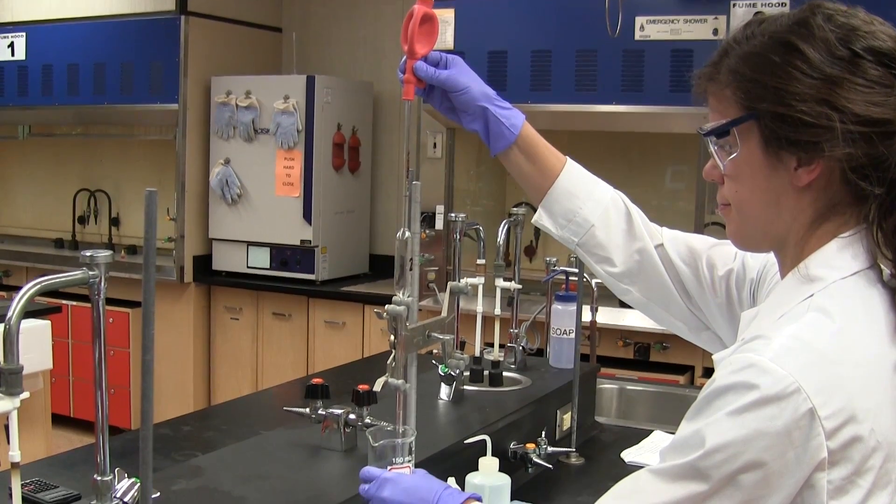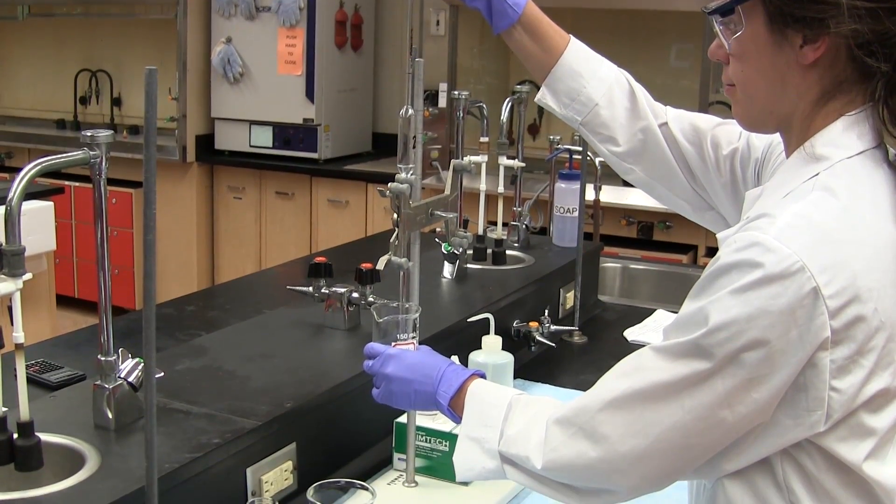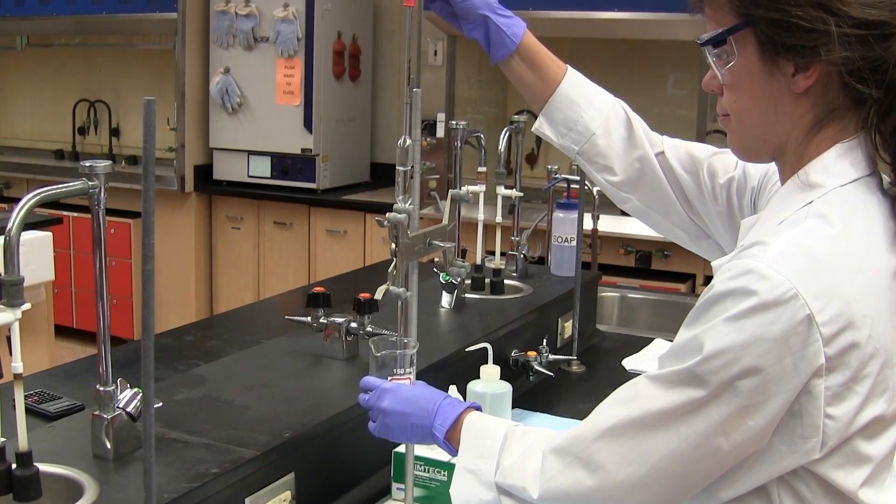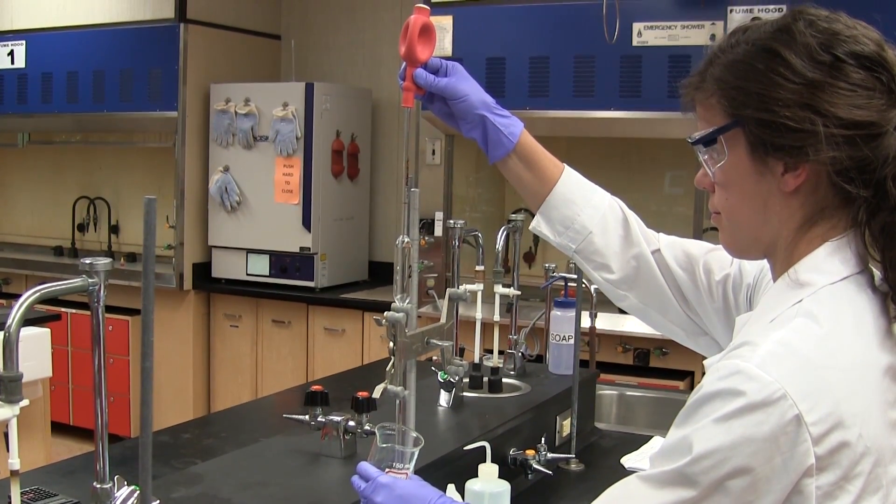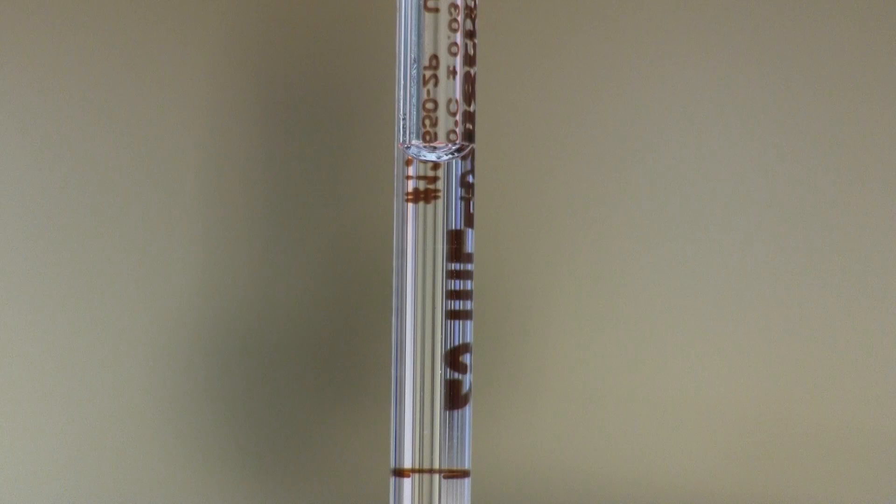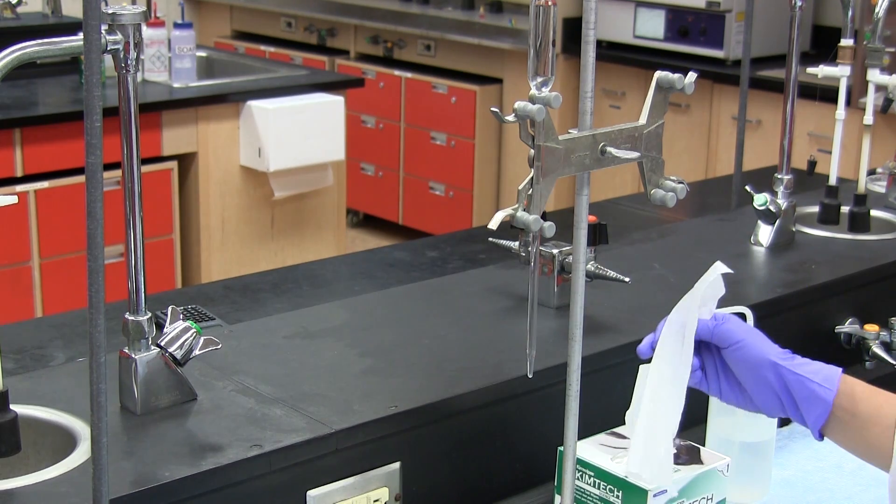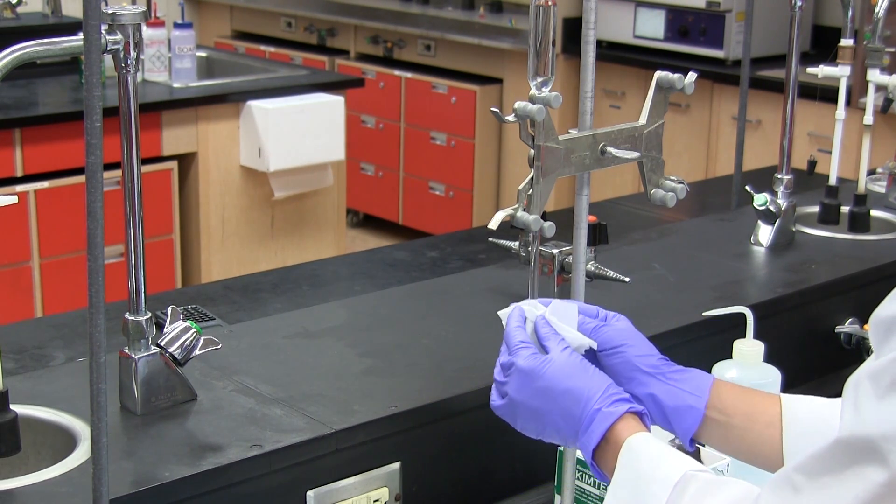The tip of the pipette is immersed in the solution to be transferred and using a pipette filler the solution is sucked into the pipette until the meniscus is two to three centimeters above the calibration mark. The pipette is removed from the solution and the tip is dried with a tissue.